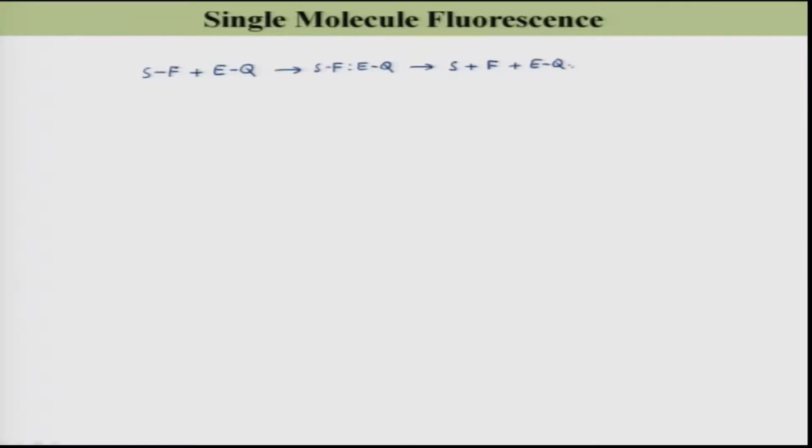If you want to study the kinetics of this reaction, what should you do? I am talking about our normal fluorimetric assay of this enzymatic reaction.